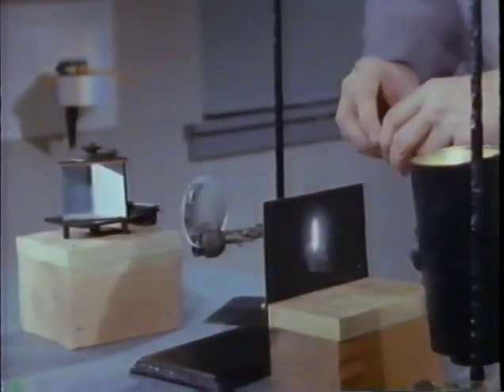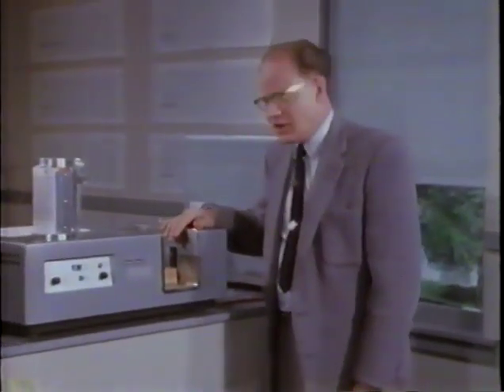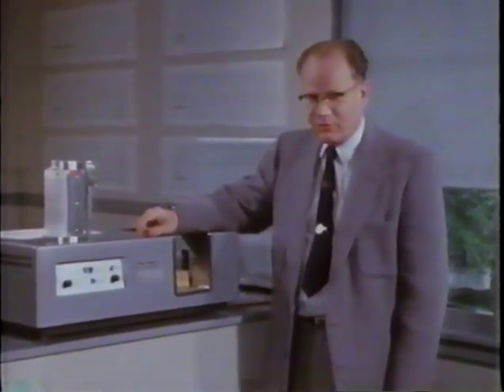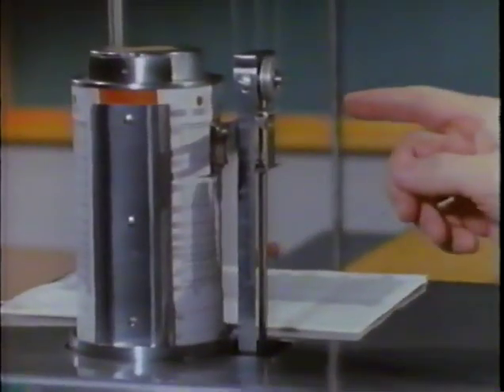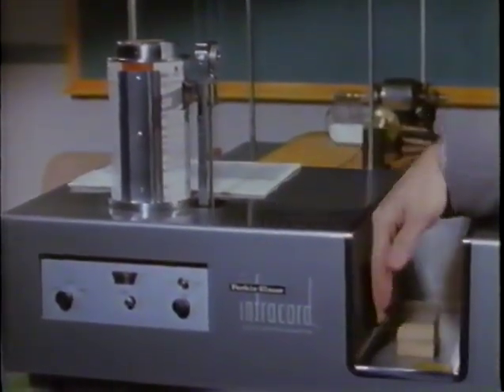Now let's see how molecules will affect the spectrum. This solution of copper sulfate absorbs in the red region, transmitting the blue. Different materials absorb the various colors of the visible spectrum at different frequencies. Here, we have a spectrometer which scans the infrared spectrum and draws a graph of the transmission of the sample in the infrared. In this spectrometer, the instrument runs through frequencies in the infrared range, around 10^13 cycles per second. The top of the chart corresponds to 100% transmission, the bottom to zero transmission.